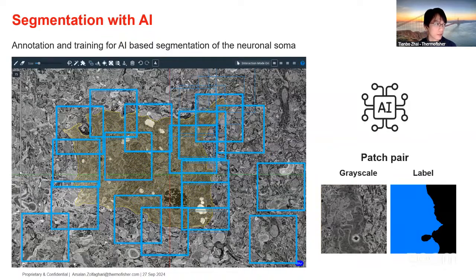Because at this point, when we try to apply the model, after we teach the machine how to recognize the pattern, we extract that deep learning model and then we try to apply it. During that process, it's an educated guess from the machine side to tell us how we should classify individual pixels.